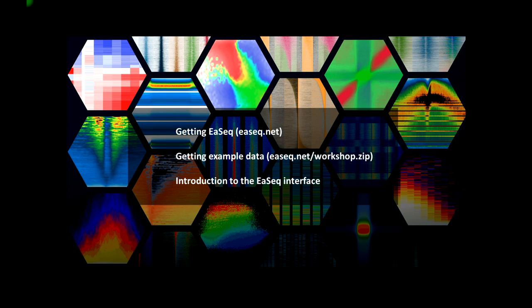Hello and welcome to this introduction video. My name is Mattis Lairdrup. I am the creator of EASEQ and I would like to show you how to get and install EASEQ, as well as how to get a few example datasets that you can use to play around and learn using EASEQ. I will also introduce you to some of the basic parts of EASEQ's interface.